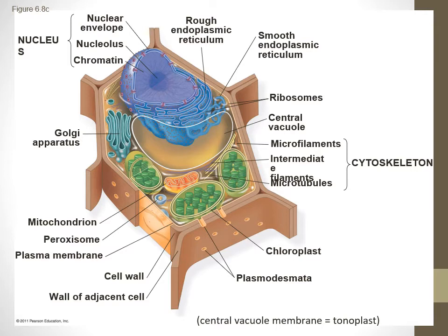So in a future lab, if you were to damage these cells and you were going to measure how much of their cell membranes have been damaged, you might damage the plasma membrane, let's say with alcohol, with ethanol, the stuff that we use to sanitize our hands. We could damage this outer membrane, and then that ethanol could seep in and damage this membrane around the vacuole, and then that red stuff would leak out, and we could measure how much of it leaks out. And we could infer that the more red stuff that leaks out, the more we've damaged those membranes. We've either destroyed the proteins or we've knocked apart the phospholipid bilayer.